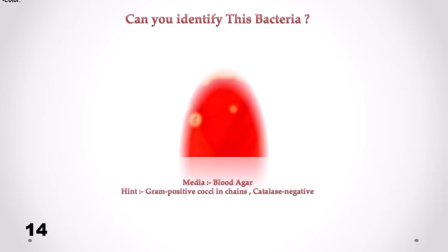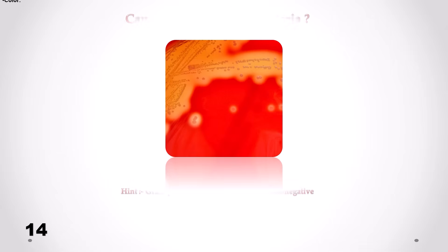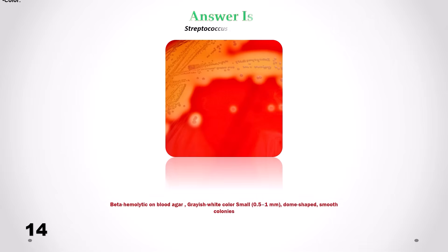Can you identify this bacteria? Correct answer is Streptococcus pyogenes. We can see beta-hemolytic, grayish to white color, small dome-shaped smooth colonies.